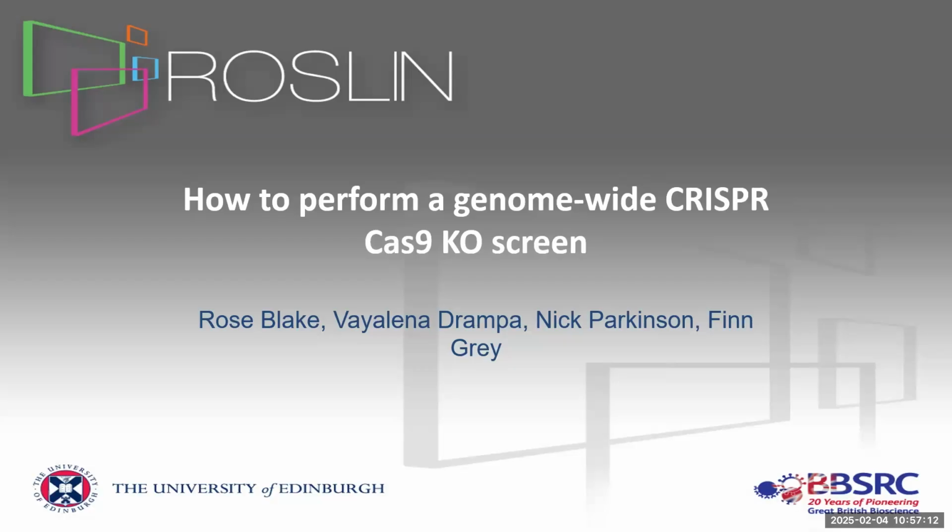Okay, so the idea behind this is to go through the whole of one of the flow cytometry screens that we've been doing and go in a bit more detail about some of the technical aspects that need to be considered. I've not done this tutorial before, so we'll see how it goes. Yeah, feedback at the end, I guess.